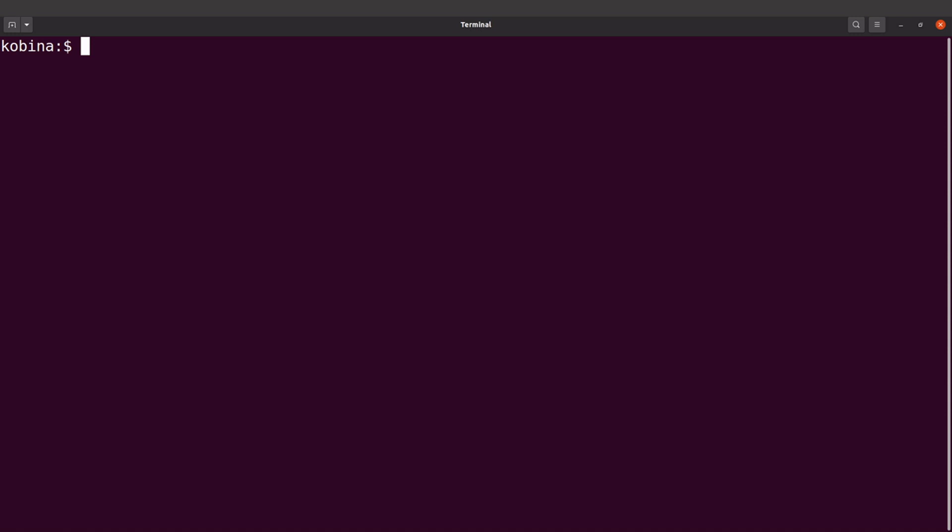Let's start with the first from bioconda. We say conda config --add channels bioconda. Let's add the second channel.